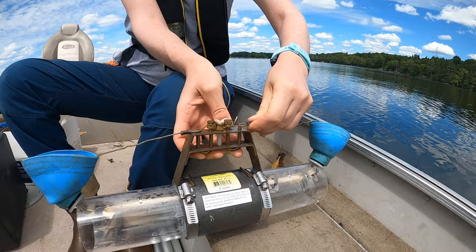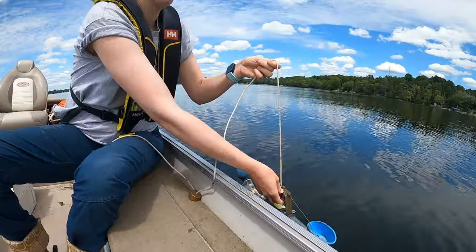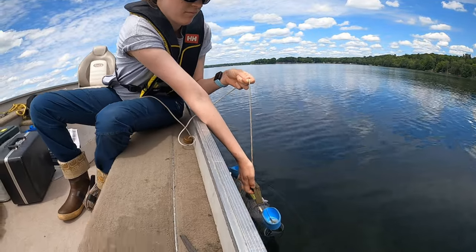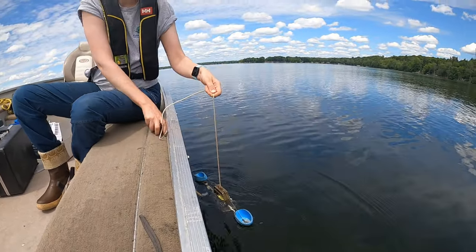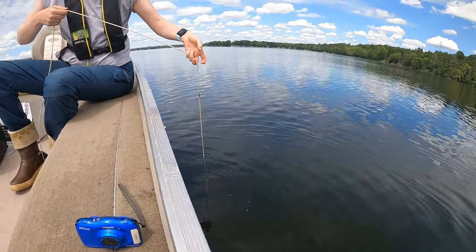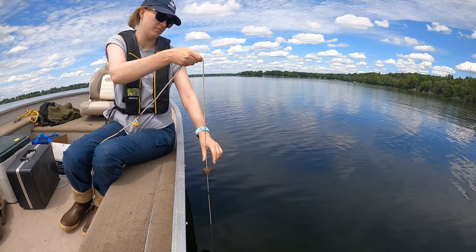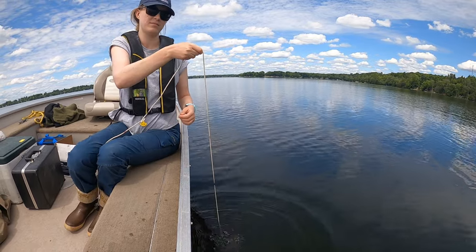But why is this essential? Water quality is a fundamental indicator of the health of our ecosystems and the well-being of our communities. Here at Kawartha Conservation, we understand the significance of water quality in ensuring a sustainable future. That's why we employ the Van Dorn water sampler as one of our key tools in our integrated watershed management program.